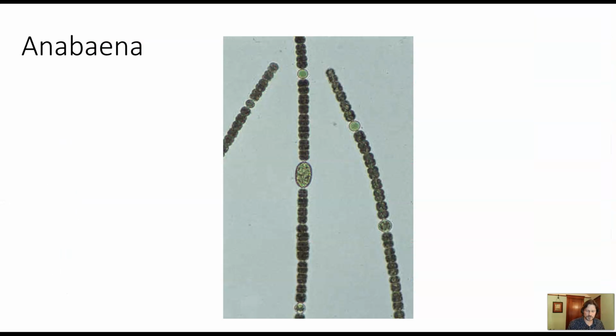In our fresh material, you'd see this one is clearer. One of these is a little bit clearer. Then you have one that's much larger, and then you have all the others that are pretty much the same. So those are our three different types of cells.